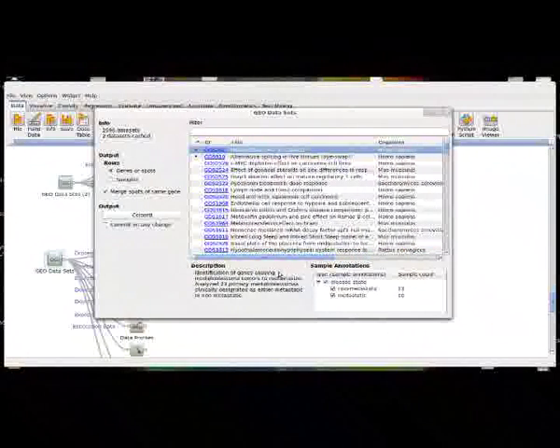So it's very important in the field of bioinformatics to determine what are the genes of interest that help decide whether a tumor is going to be deadly for the patient with it, or what is the biological indicator that allows us to know if this tumor is more dangerous or of a different type, which can lead to different approaches for personalized treatment in the medicine field.